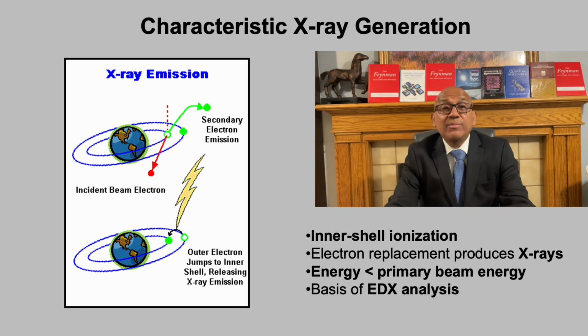This is the physical basis of energy dispersive X-ray spectroscopy, or EDX, which enables elemental analysis directly within the scanning electron microscope. Compared to SE and BSE imaging, X-ray analysis sacrifices spatial resolution, but provides direct chemical information, making it an essential complementary technique.